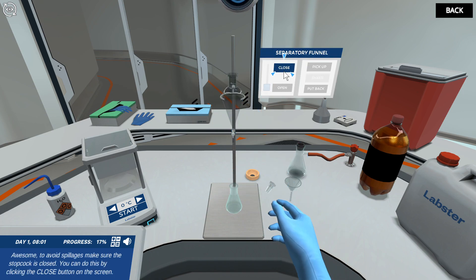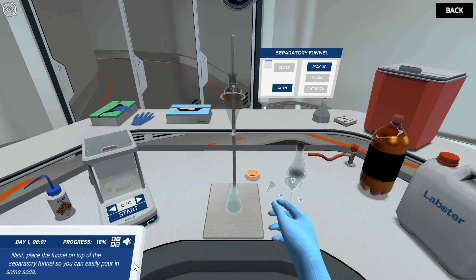Awesome! To avoid spillages, make sure the stopcock is closed. Next, place the funnel on top of the separatory funnel so you can easily pour in some soda.